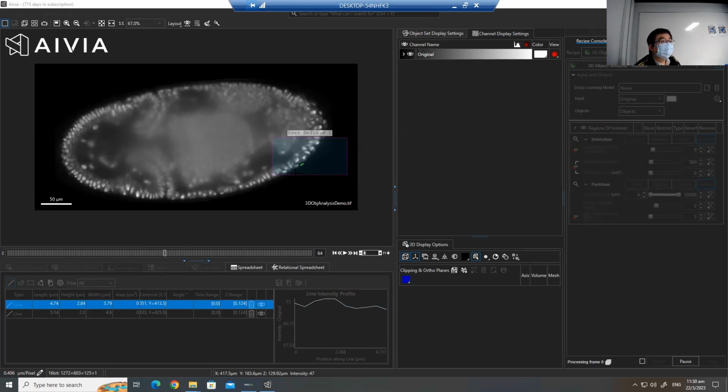Yeah, this is not just one layer, it's 3D. If you preview it, that ROI is in 3D. If you apply this setting, the preview is generated in 3D. I will show you later. This is 3D. It's applied to 3D. You can check it in 3D. Just enable the ROI and then go to 3D, click the preview, and then you can check the partition in 3D.